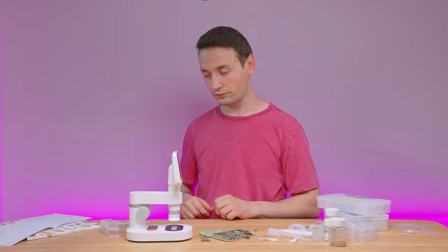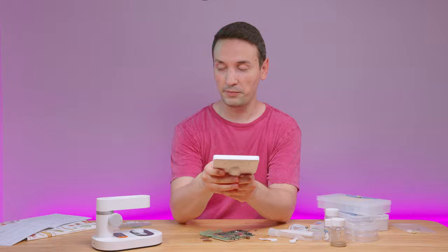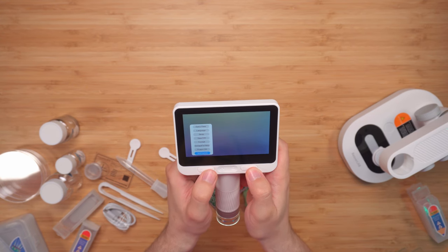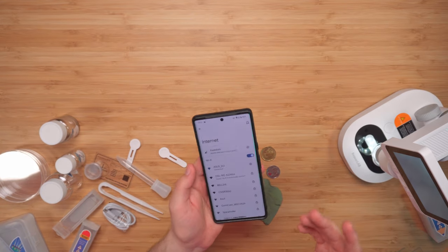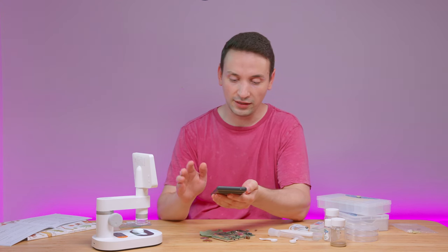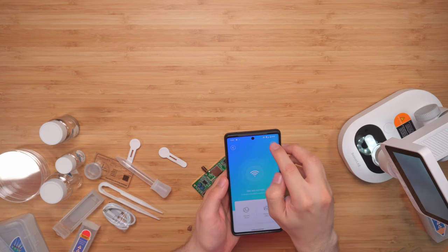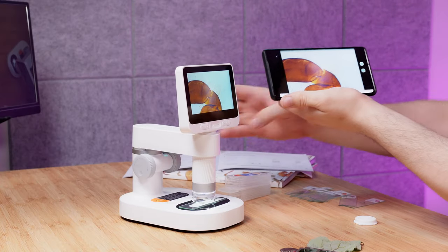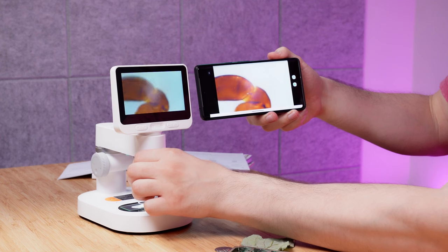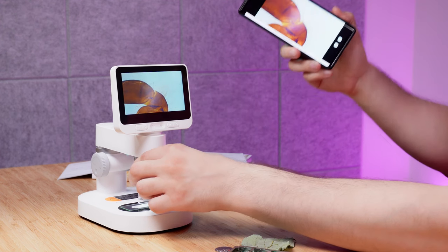The alternative is connecting this to your smartphone. Going into settings and turning on the Wi-Fi switch, you connect to the network 'DDL M2' with the password '12345678.' Once connected, it says the device is connected. Clicking the live view button, you can see it's almost instant — the response when adjusting focus over Wi-Fi is very quick.